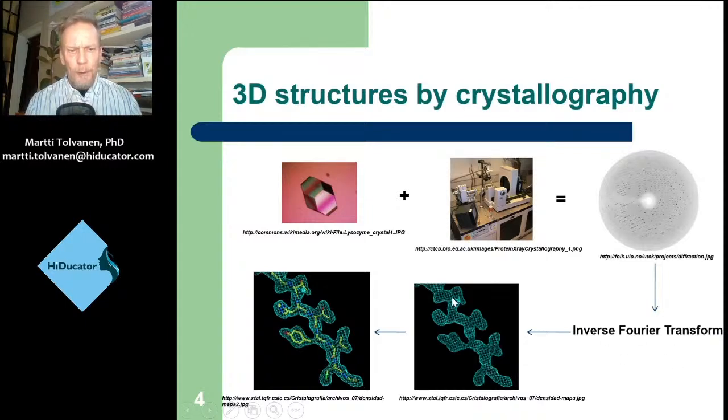And once you are there, the electron density can be fitted with the protein sequence, and you get an atomic model of what you wanted to study in the first place, the protein you crystallized. And then you might be iterating between creating the phases with the help of an improved model, get an improved electron density and remodel and so on.